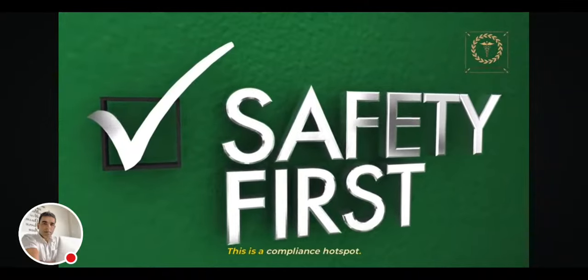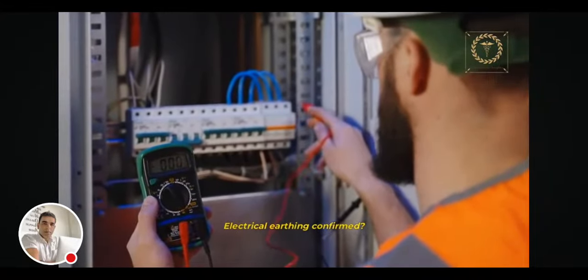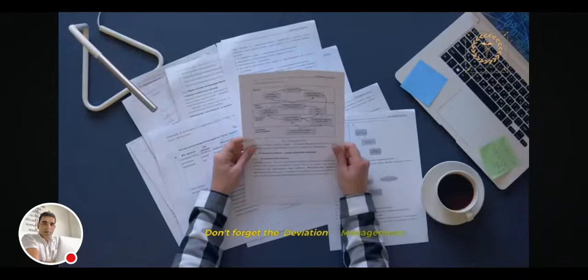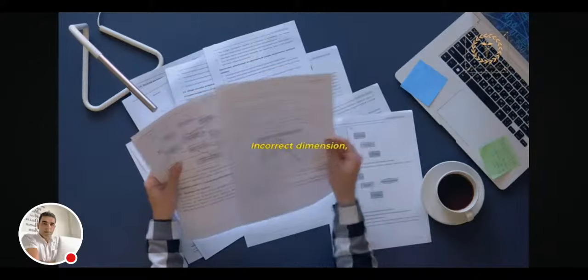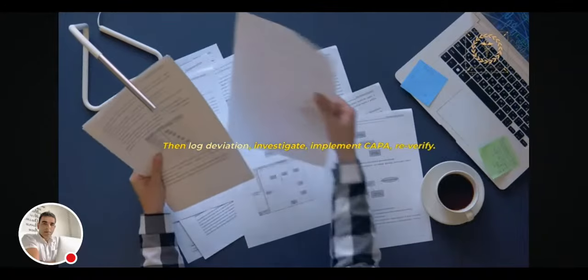This is a compliance hotspot. Emergency stop button tested. Electrical earthing confirmed. Audible, visual alarms functional. Fire retardant panels used. Don't forget the deviation management. Document any mismatch, such as utility connection missing, incorrect dimension, calibration tag expired, then log deviation, investigate, implement CAPA, re-verify.